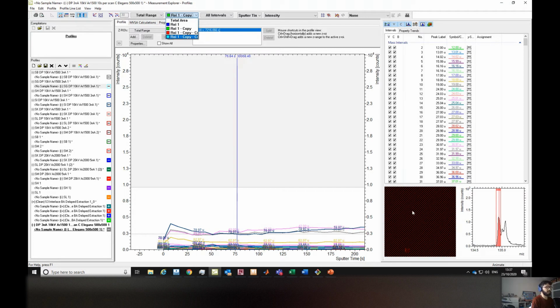And as I said, they don't necessarily have to have the same area, like this square here. They're all the same size, but it doesn't have to be like this. You can make bigger ones, but just keep in mind that you may have different levels of noise for each of the data sets.